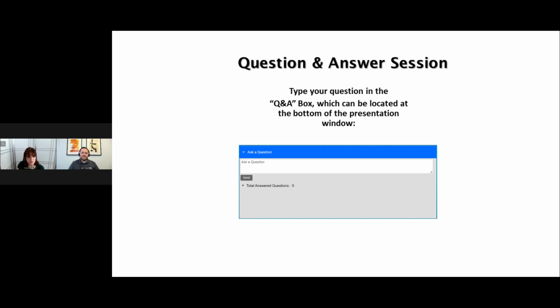Great, thank you. So another great audience question that came in: can you add DART to this application to eliminate chromatography? Sure. So DART is fully enabled with some of these workflows that we have. Usually the way that we would use DART in this sort of situation is as more of a screening technique. So for example, if we have some known samples and we want to quickly go through a lot of these samples with relatively minimal sample prep and time, we can go through and screen for some PFAS in there. And then maybe for the ones that come up positive, we can do a further confirmation by LCMS.